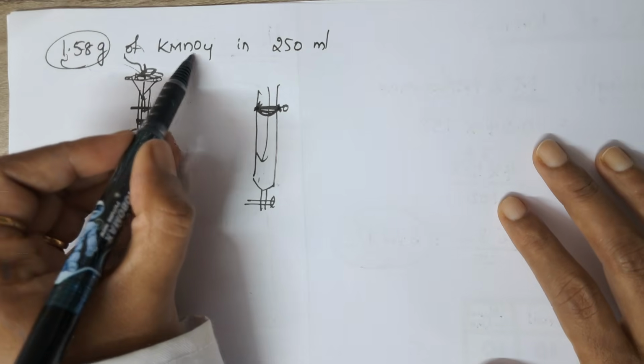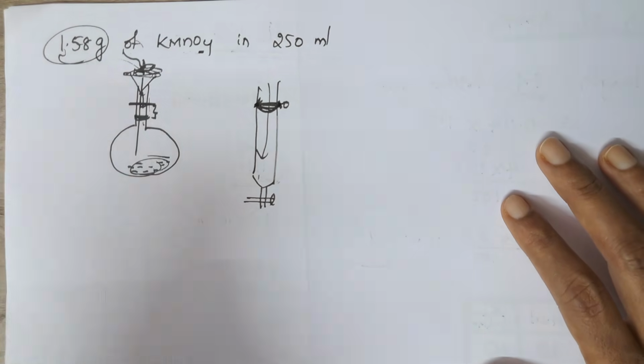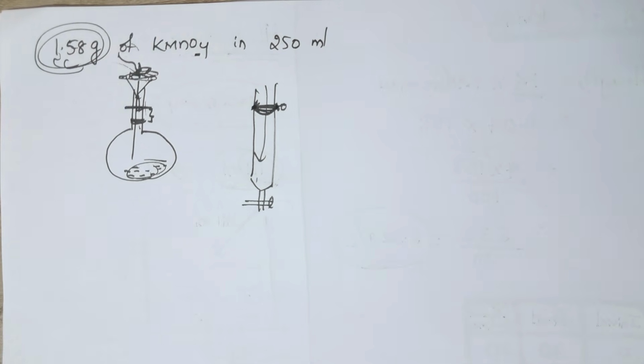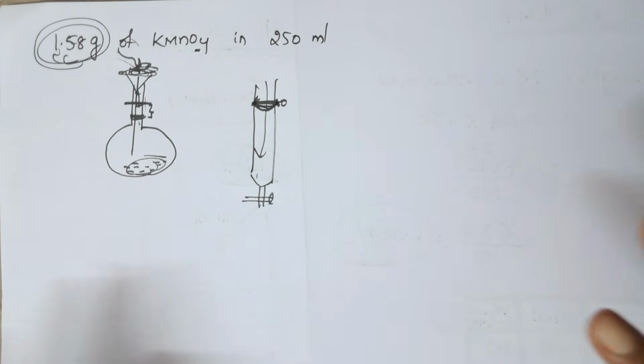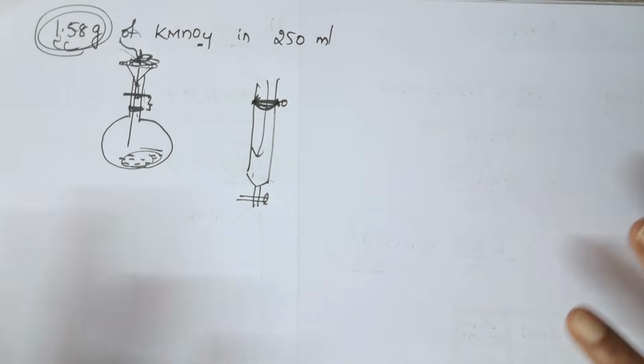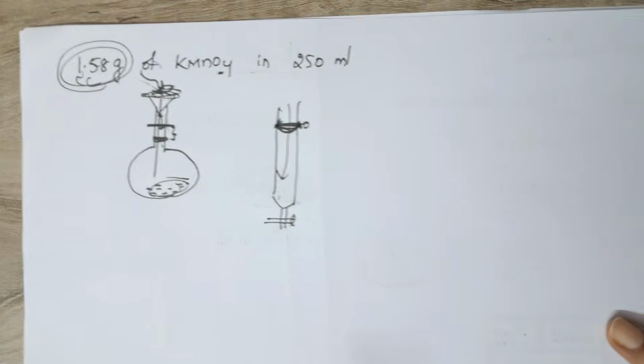And this KMnO4, mostly you do not need to prepare. You are only going to find its concentration. I am just giving you the information. If you want to do this in your lab with every ingredient, from scratch level onwards, I have given the complete information.